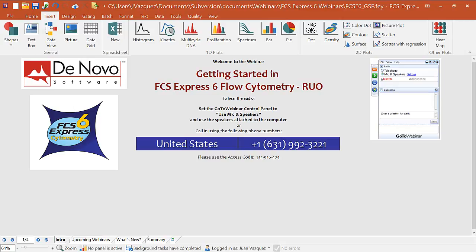If you need to make a high-res image for a publication, you don't need to take an object and import it into Photoshop to manipulate it or to get it how you need to. You can actually do that here. You can format a plot, make it as visually pleasing as possible, and you can export it in as high of a resolution as needed for publication.